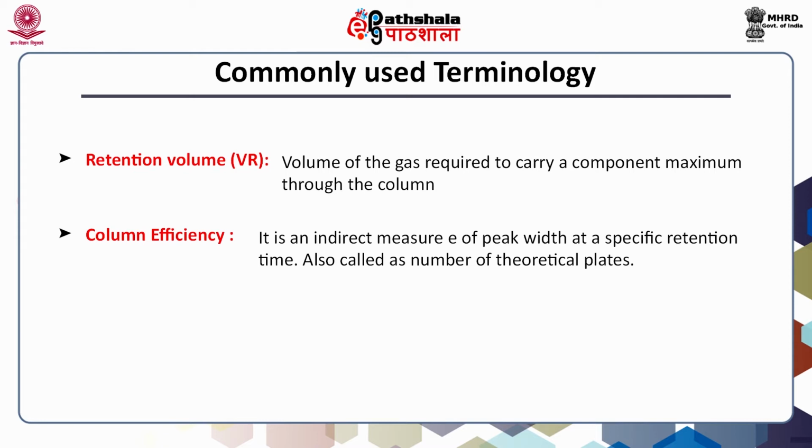Column efficiency is basically found by way of theoretical plates, and these theoretical plates, as the name indicates, are theoretical. That means, when the number of theoretical plates of any column is very high, then the efficiency of that column is also considered very high.